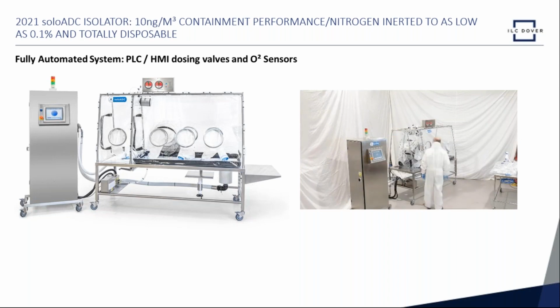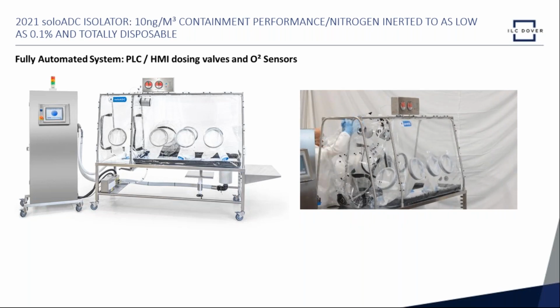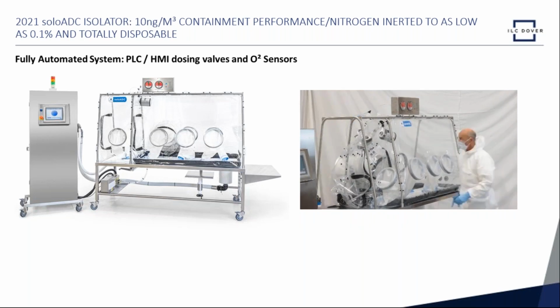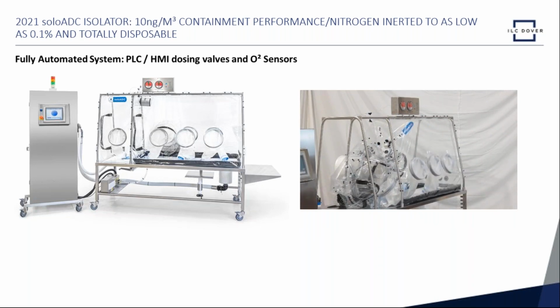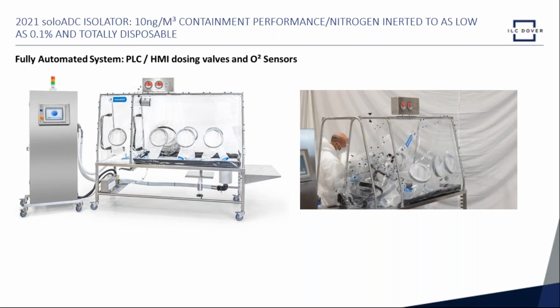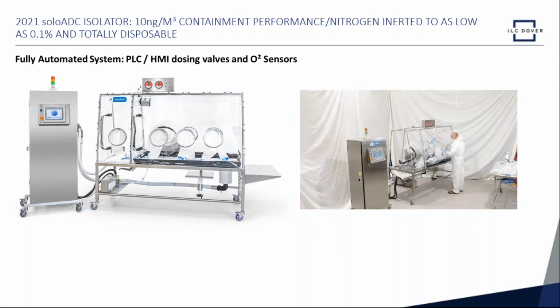We're keeping the fan exhaust going to pull the gas and air mixture, if it is gas and air or just nitrogen, out of the chamber. The HEPA filters are sealed to the flexible enclosure, and as we unpopper the flexible enclosure from the frame, it becomes more manageable for disposal. The continuous liner system for exit, that's part of the disposable enclosure.